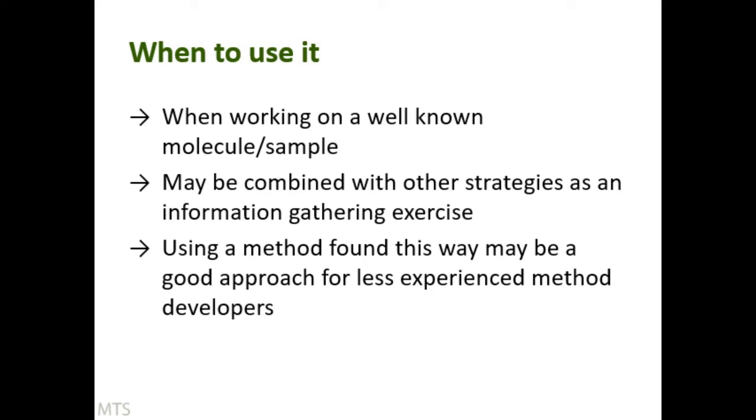Or if you haven't a lot of experience with method development, it could be a great way to start, to begin. So you could say, okay, well, I will use their method. I'll see how that goes. Now, the idea of a paper, obviously, is so that somebody else can follow that and get the same results as you. But you might find that doesn't always quite happen the way you expect. So occasionally you might struggle to get a method from the literature to work.